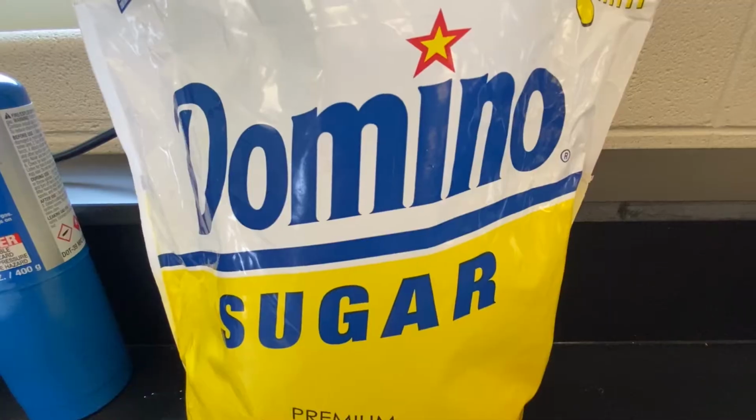All right, so what we're going to do is chemically and physically change sugar in this lab. Your job is to differentiate when a physical change is happening and a chemical change is happening. But I'm really interested in not just can you identify it, because I think it's easy, but can you tell me why a chemical change is happening when it is, and why a physical change is happening when it is. All right, now that you've had enough background, let me show you the lab setup.